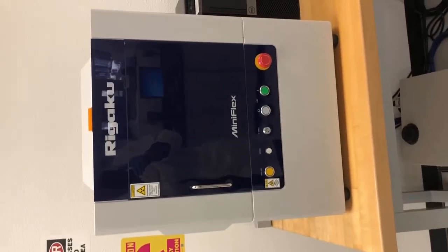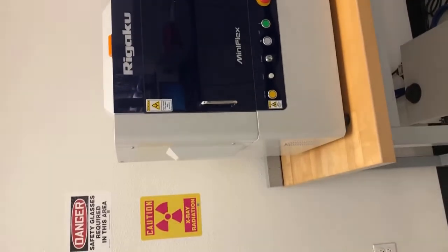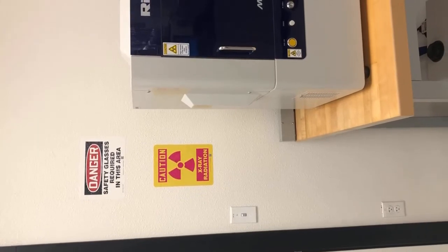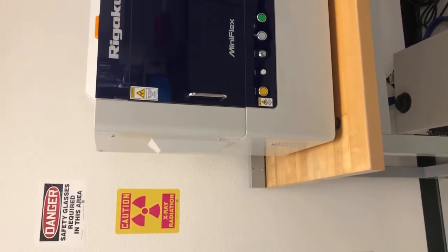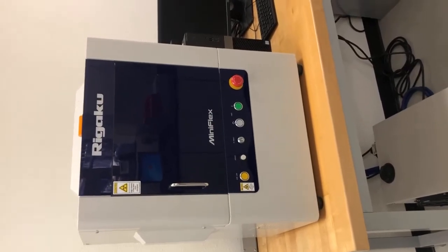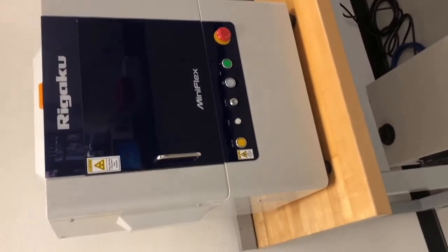We have a Rigaku XRD machine right here. We'll be looking at this extensively in our first lab, the XRD lab. This is an X-ray radiation source. For two years I tested and wore a tag to see if I was getting any radiation. You'll see that this machine has really excellent safety equipment and will prevent you from being energized by an X-ray. I love this piece of equipment because of the safety features — and you'll see why I hate it in just a little bit.